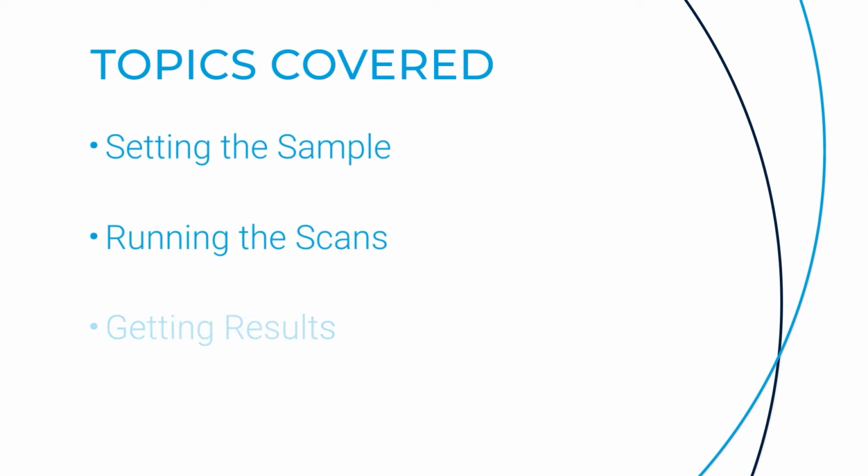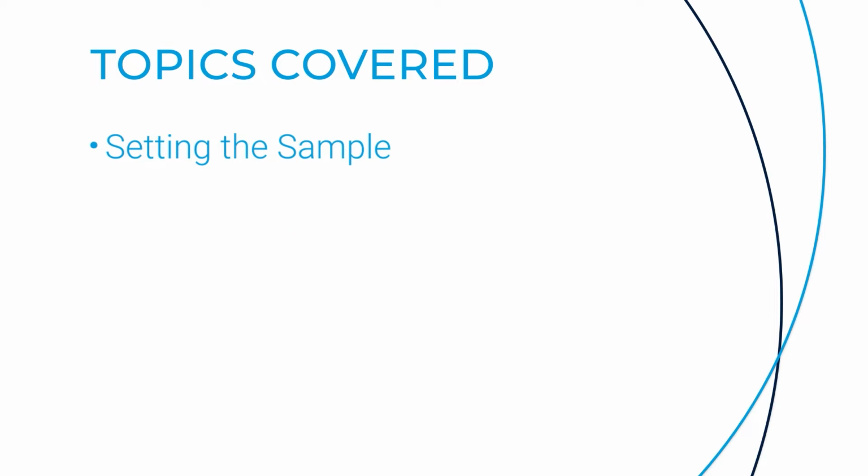Hello, are you interested in using a CT scanner for your research but aren't sure how it works or what's involved? Don't worry, because today I'm going to show you the process starting from setting a sample, running scans, and getting results. I'm Angela Criswell, and today I'm going to demonstrate our most versatile microCT scanner.